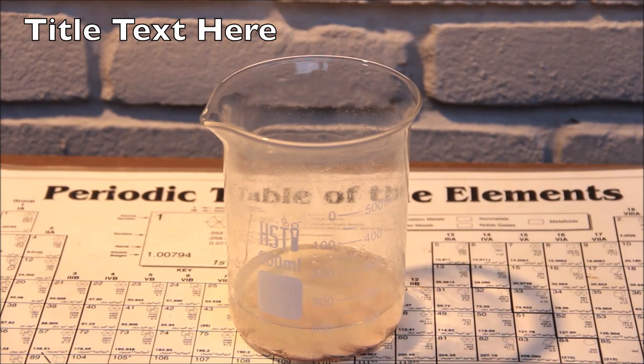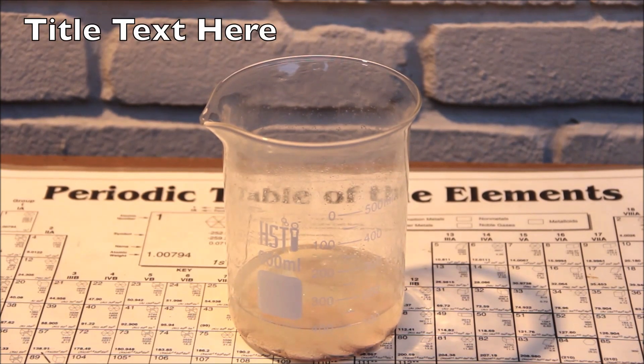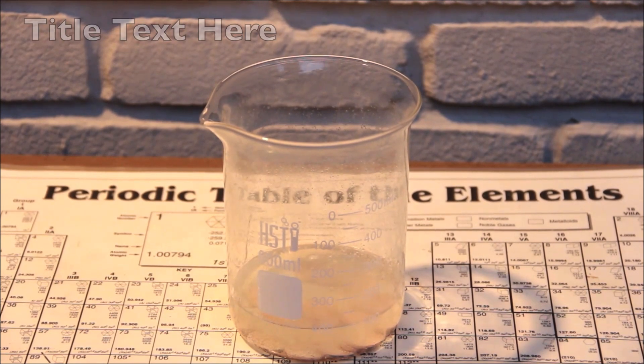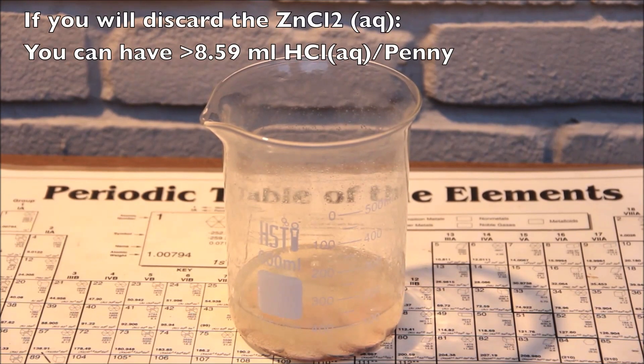If you are going to discard the solution of zinc chloride, then you can have an excess of hydrochloric acid. If you are going to keep it for the next experiment, you should have an excess of zinc.